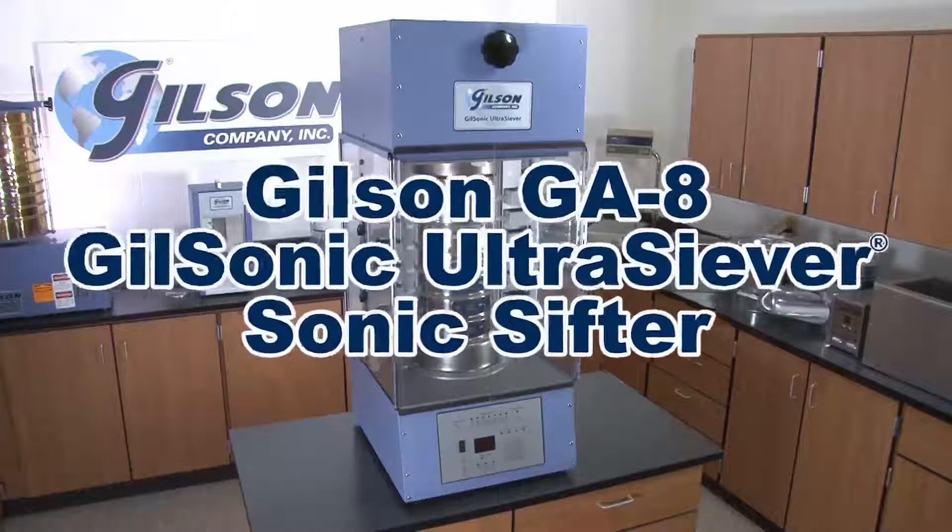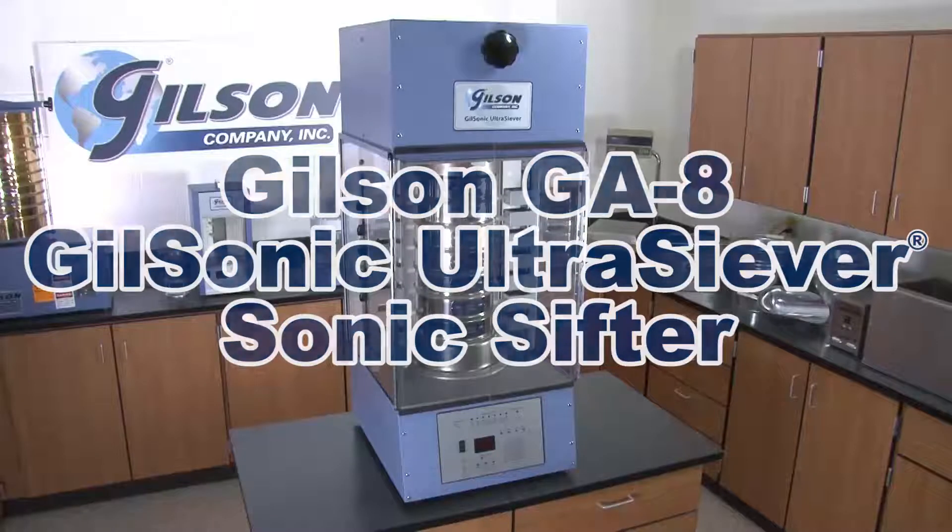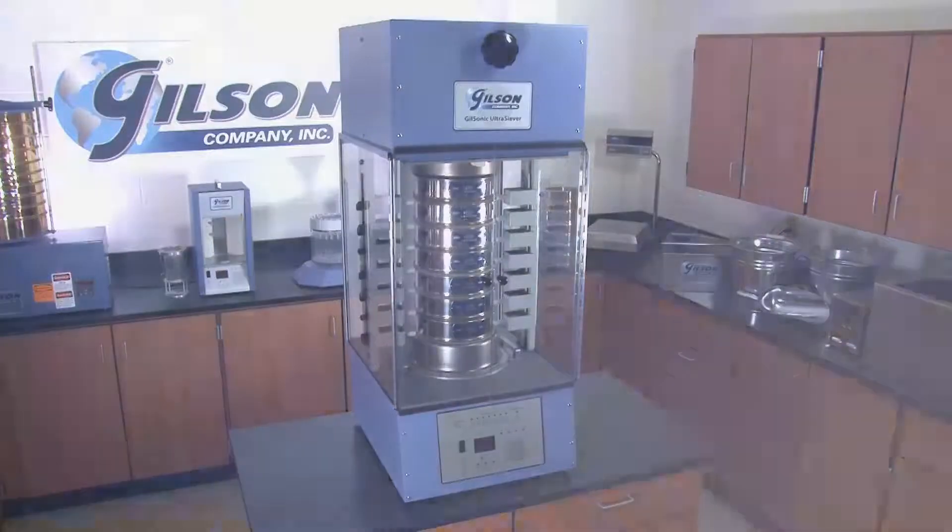The Gilsonic Ultrasiever Sonic Sifter for fast, accurate, and repeatable particle separations.